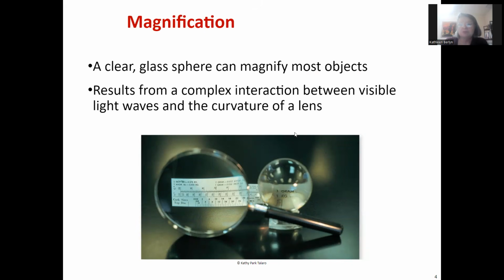So in order to observe things in microbiology, as we said, you have to look at them through a microscope.